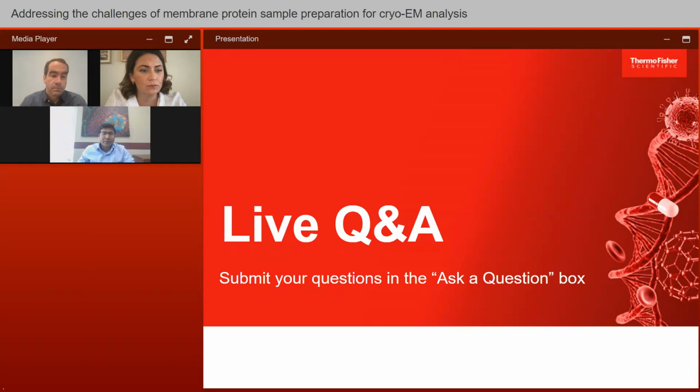Yeah, thanks, Eddie, for the question. So no, the short answer. We optimize everything, including concentration and buffer conditions, so there is no issue of aggregation. So you can directly apply it to the grids.